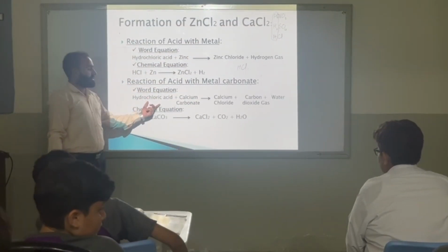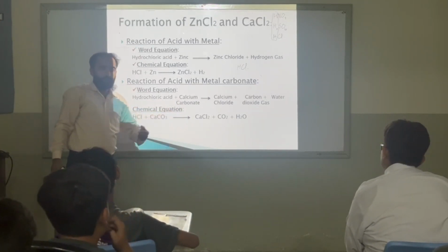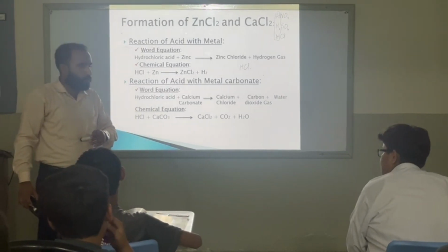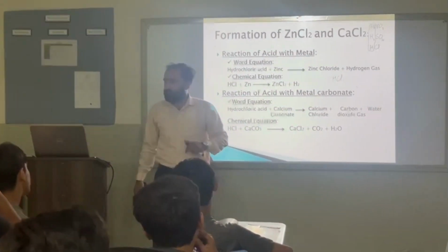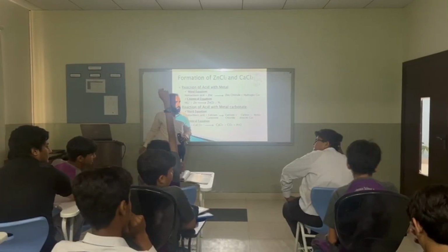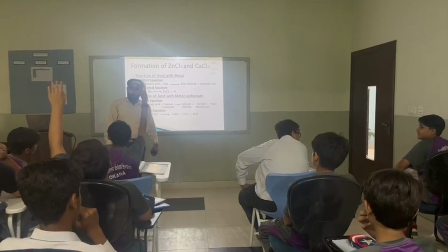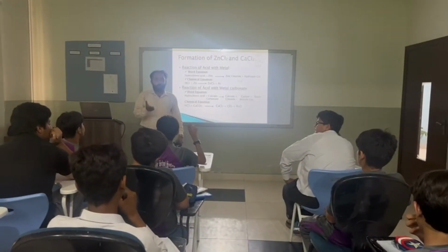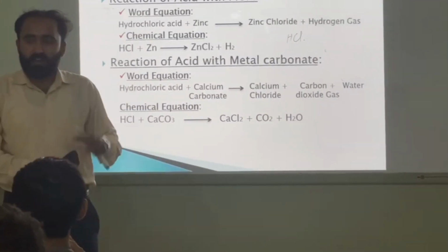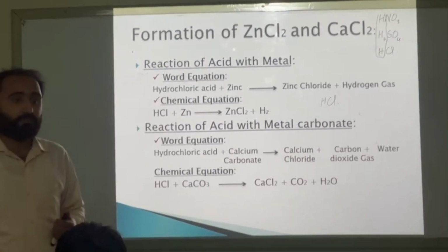We have hydrochloric acid and calcium carbonate. Dear students, can you tell me, have you seen calcium carbonate in your daily life? Marble, exactly. Marble chips are actually calcium carbonate. Chalk is also calcium carbonate.